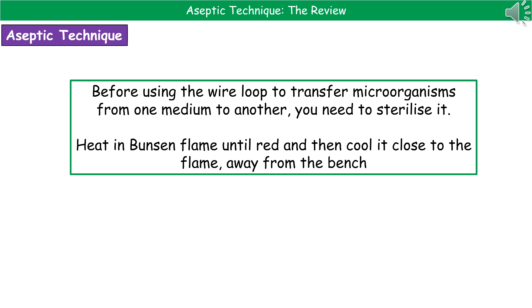The way we achieve this is by heating the wire loop in a Bunsen flame until it glows red hot. We then hold it just outside the Bunsen flame, away from the bench, to let it cool down. You obviously don't want to stick it red hot into your sample, as there wouldn't be much living after that. You keep it in the air, away from the bench, so nothing from the bench contacts your sterilized loop, but just out of the flame so it cools down without airborne contamination.